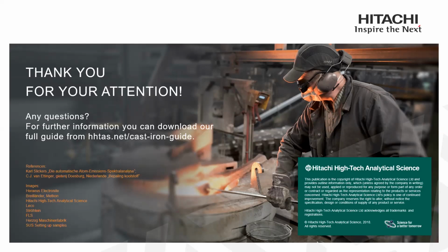Another person asked, do I need to burn longer to measure carbon and iron using a portable instrument? You will need to burn longer. With our iron base, we have a cast iron function, and if we run any samples on it, the cast iron is probably a 3 or 4 second longer measurement than any other measurement. This is to burn through the initial layer of carbon so that you're actually analyzing the material itself.